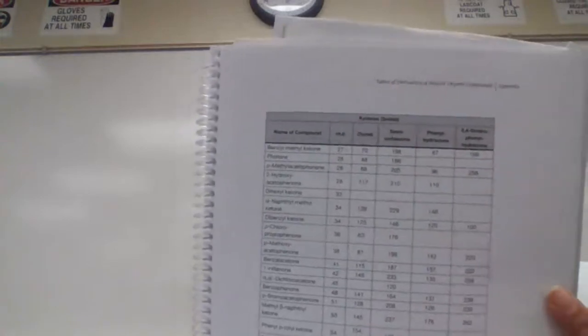In order to pick the proper derivatized compound, we have to look at different columns and see.